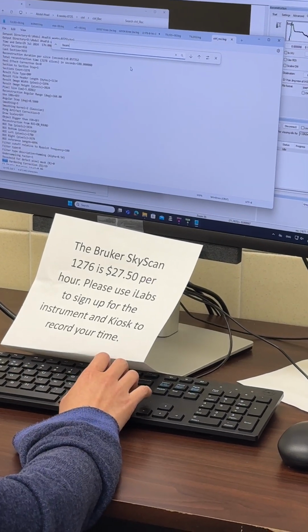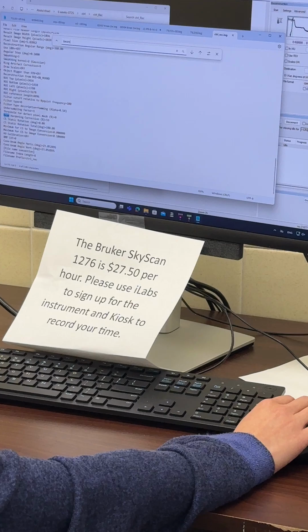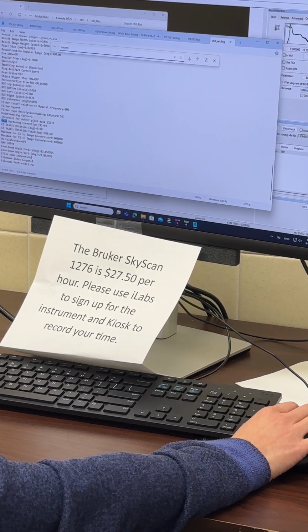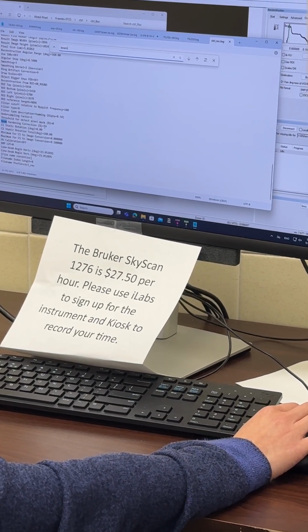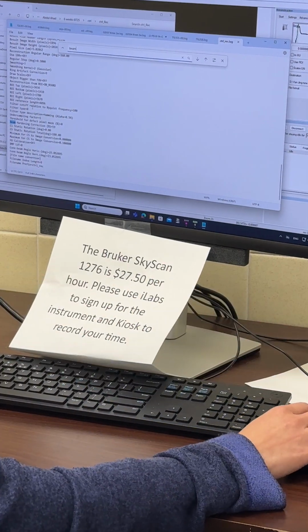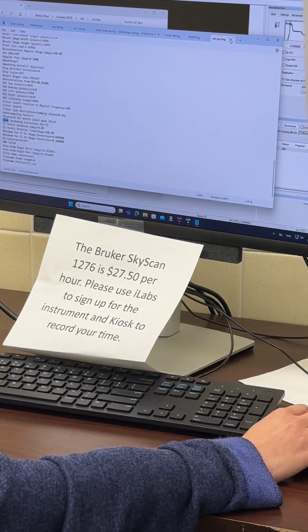B-E-A-M, Bing hardening, whatever. Great. So all the settings will save here. If you don't remember, you can open this one. And the others, like beam hardening, smoothing, and this thing, just keep the same. If it's 59 before, that's his project. Ours is 54. Okay, and only change the misalignment.